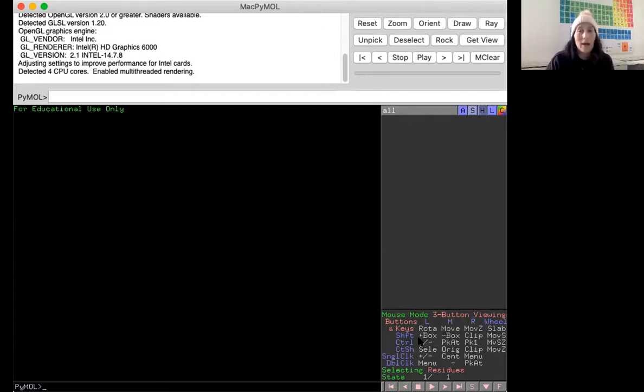Really the best thing to do in Pymol is just get a protein in this display box and just start clicking on things and messing things around. The biggest downfall maybe is that Pymol does not have an undo button. It's okay. I would say you're not going to break the program. In the worst case scenario, close the whole thing down, reopen it, bring back the protein that you're working with, and start over, right?